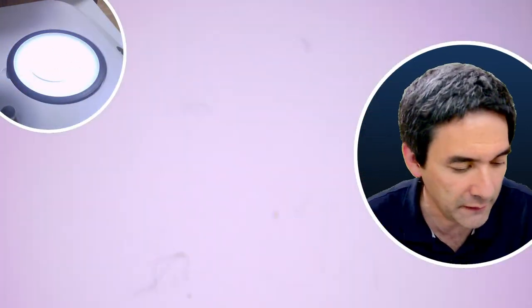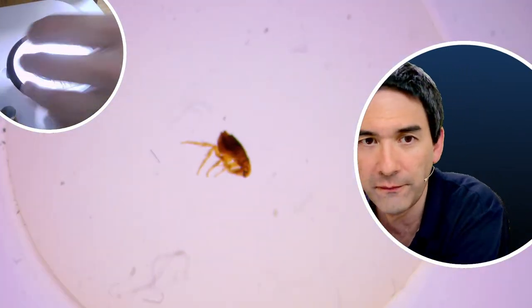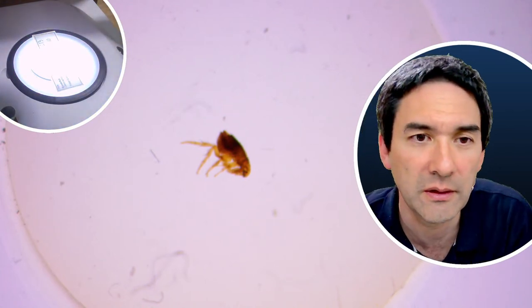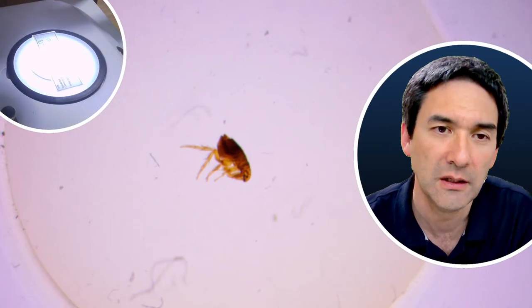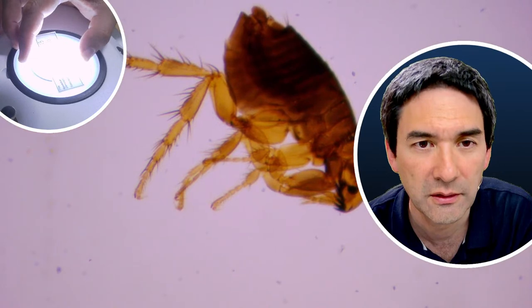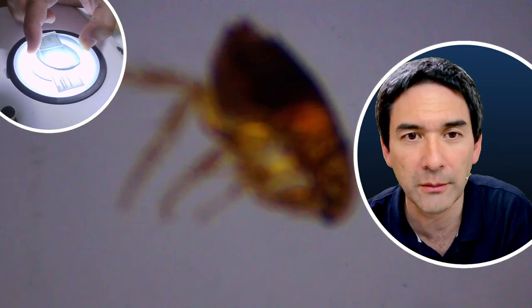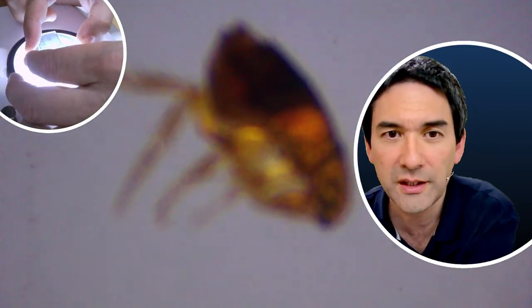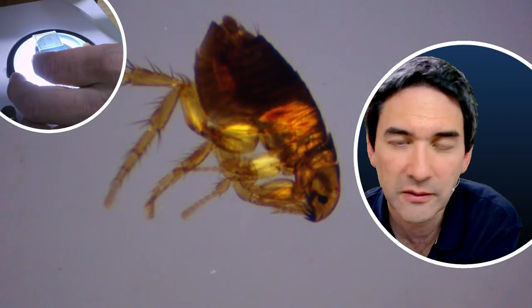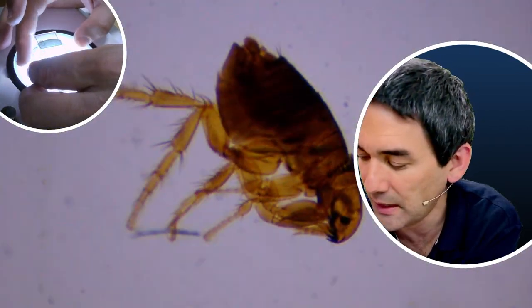Okay, and what I have here is a so-called dog flea. That's actually one of my favorite specimens that I have. And this is just basically how it looks like. That is from a commercially prepared slide. So I'm going to put the other polarization filter on over it. You see that this changes the focus a little bit. Okay. And I'm going to now rotate it until the background is black.